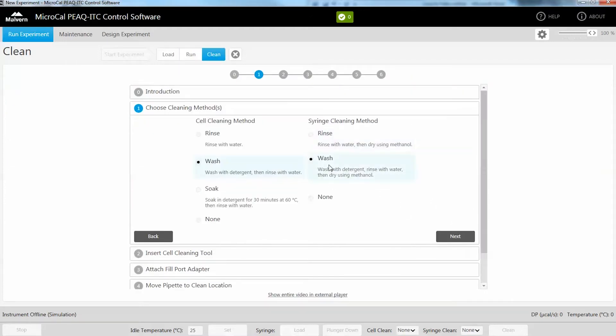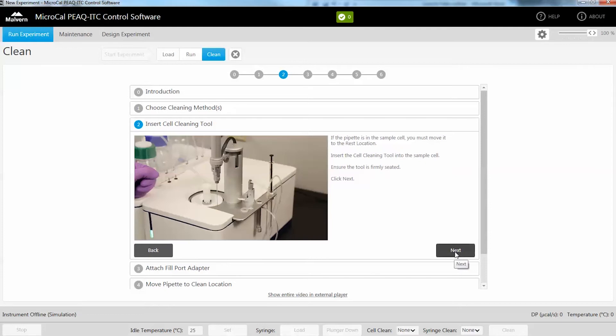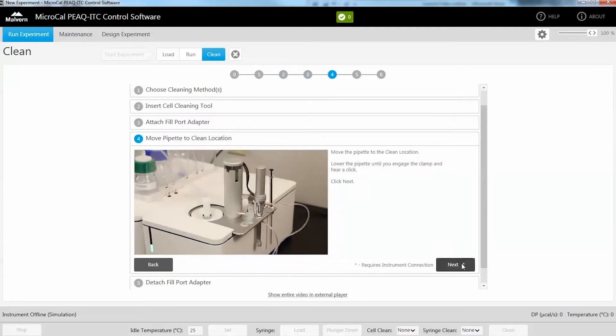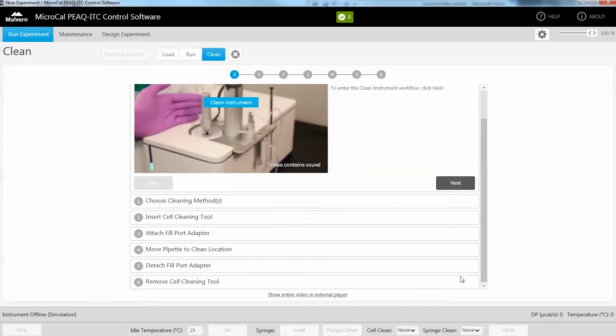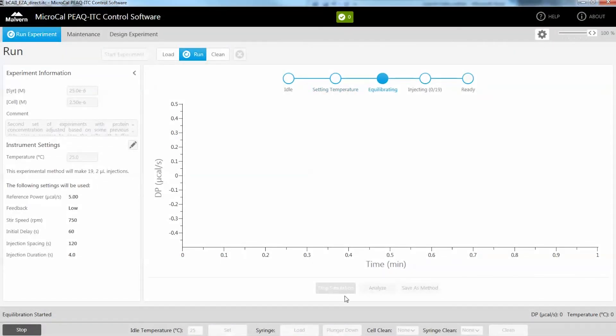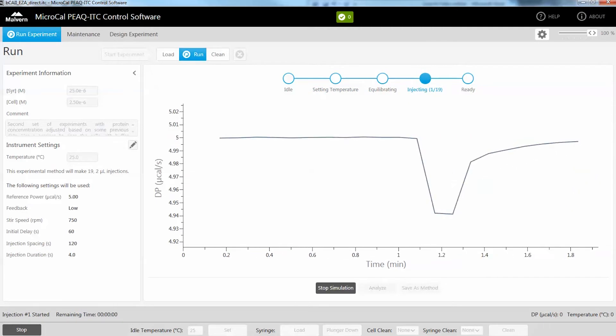In addition, the maintenance workspace steps the user through the most common procedures. This ensures you get optimal performance all the time, also in multi-user environments. For example, look how beautiful the data is with about 20 micrograms of protein.